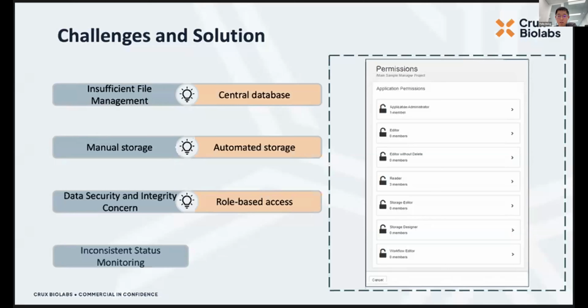But for other teams, because they're not involved so much in sample registration, shipment, or storage, they're only given access to view and update sample information. So in order to reduce the risk of samples or storage units being accidentally deleted or modified.